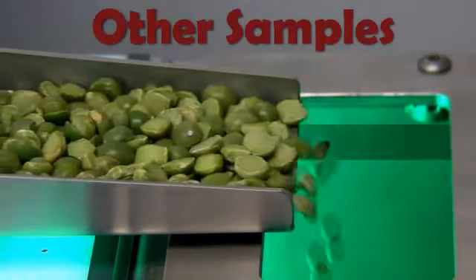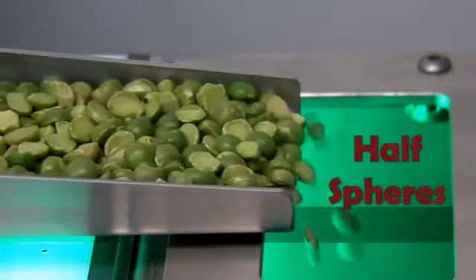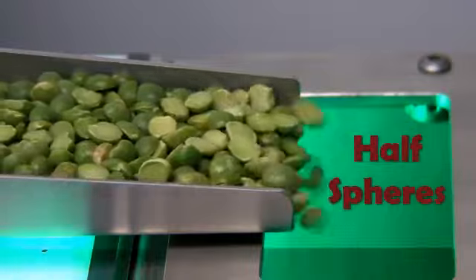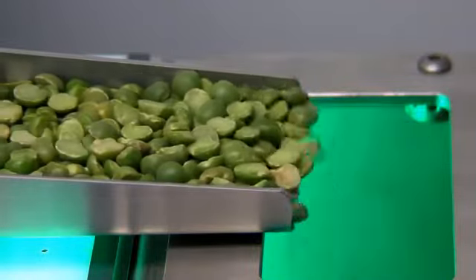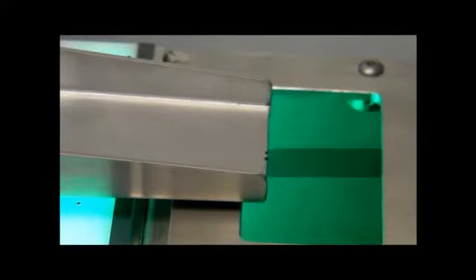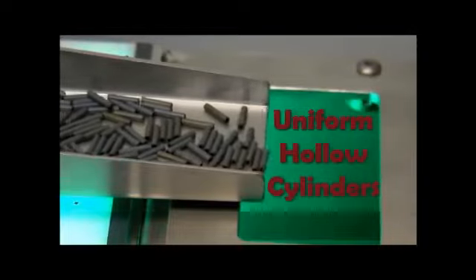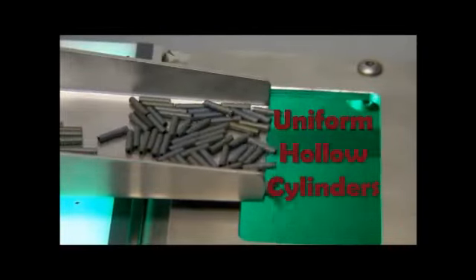Some examples of other types of samples, like half spheres. Here are some uniform hollow cylinders, which might suggest the three-dimensional monitoring of machine parts.